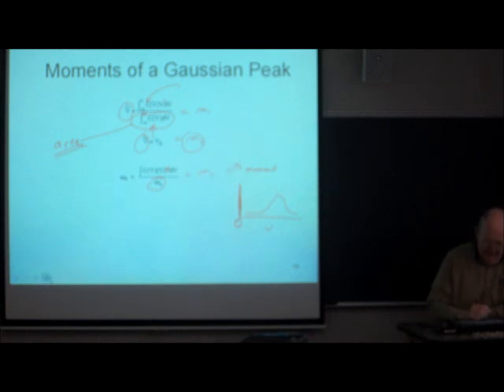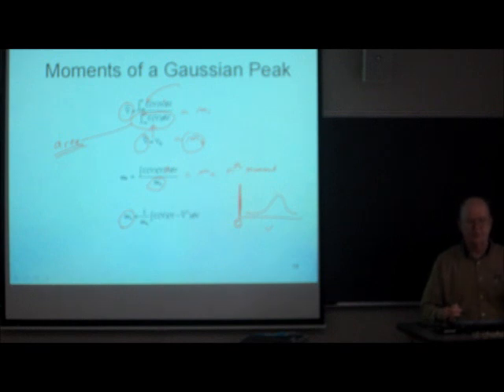It's frequently the case that for the higher moments, like the second moment, we compute the center of gravity, and then we compute the moment about the center of gravity. I just did a bad job of sketching that. There's the center of gravity.